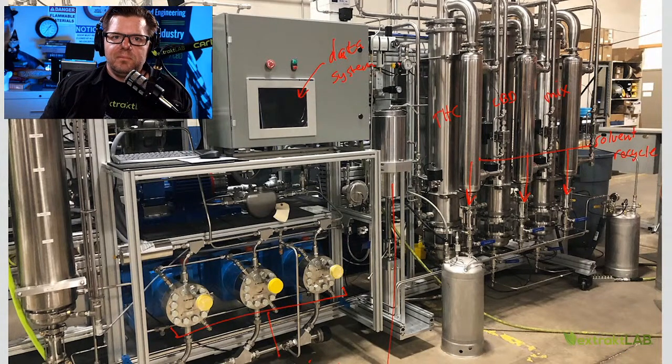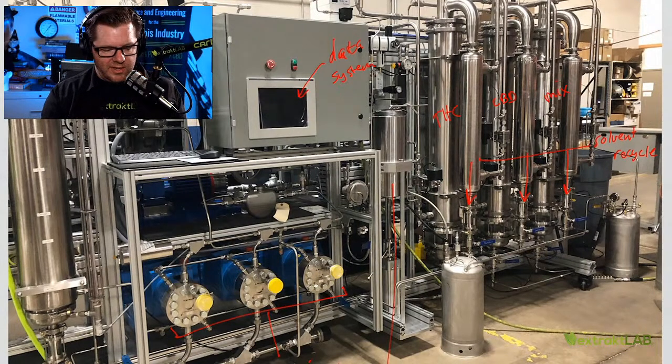So some people have tried to do separations. You have to have the right particles, and you have to have the right solvent combination, along with the right flow rate and the right detector, in order to really make the separation happen, okay? And when you put all those conditions into a method, it's called a separations method. Those are the things that you need to be thinking about when you're thinking about methods and methods development. There's lots of different variables. You put those all together. You run that method again and again and again, and you test it out. And if it's repeatable, it's a good method.